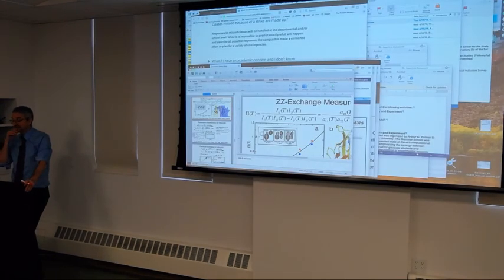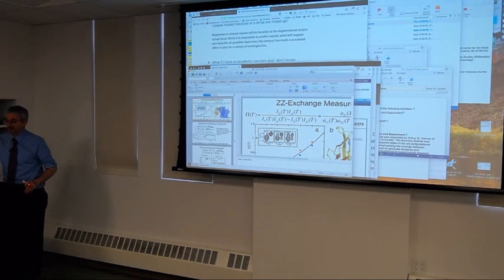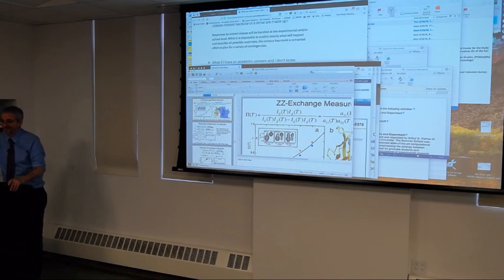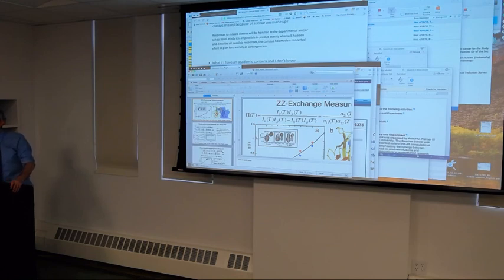I really didn't say anything about the methyl-TROSY experiments. There are methyl-TROSY experiments for doing CPMG-type experiments, but not for doing R1ρ-type experiments. So the methyl-TROSY experiments work for very large proteins. Lewis has done these on like half-megadalton complexes. But the time scale is a little more restricted because there isn't an R1ρ version that would get to higher strength fields.